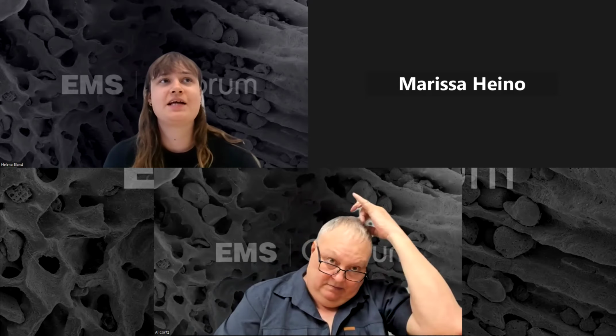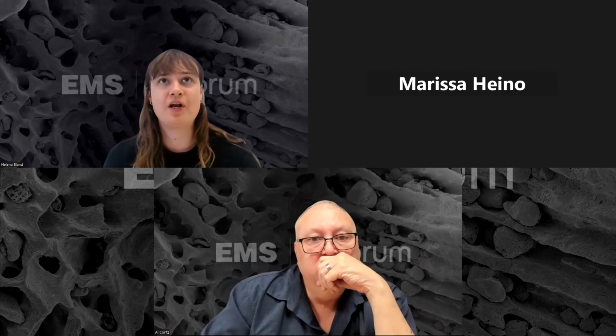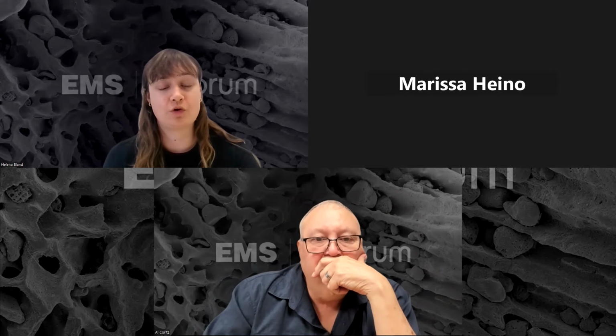Now we have a vacuum question. At a vacuum of 10 to the minus 5 for carbon evaporation, would there be cause for large flakes? Not necessarily large flakes. You wouldn't get as fine a deposition at 10 to the minus 5. I would say 10 to the minus 5 is really the minimum you'd want for carbon rod evaporation.